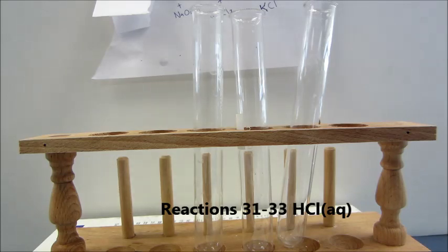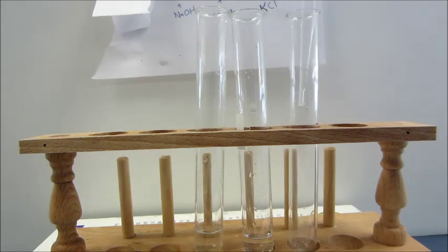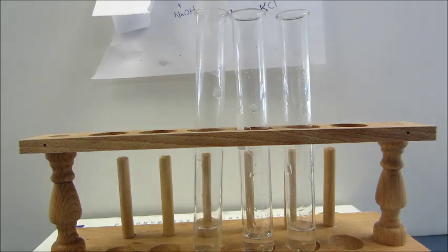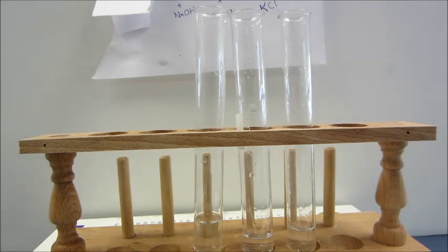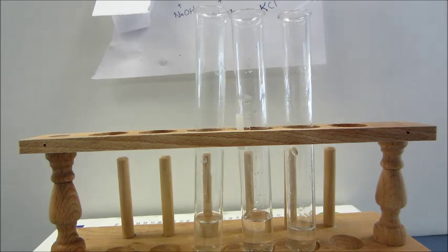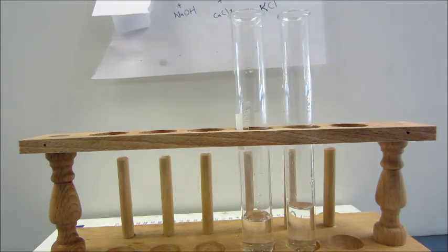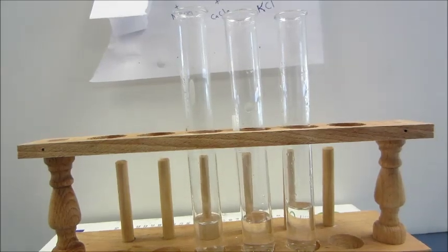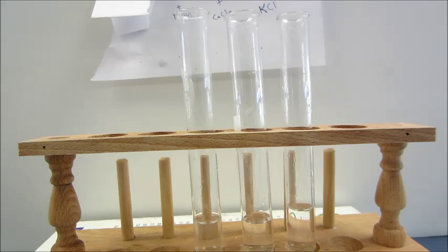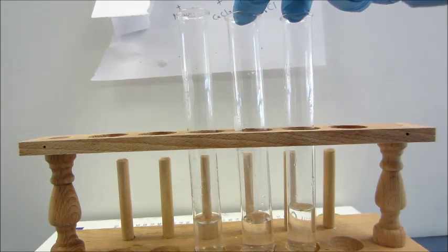Now it's time for our hydrochloric acid tests. We've got some HCl in three test tubes. To the first one, we're going to add sodium hydroxide — we predict a reaction here, since sodium hydroxide is a base. Doesn't look like anything's going on. Let's add our calcium chloride, and our potassium chloride. We see no visible reaction. With our hydrochloric acid, we predicted the sodium hydroxide would react — the sodium would leave the hydroxide, go to the chlorine, form sodium chloride, and we'd also get water, a covalent compound. But we didn't see any evidence of that. The two chloride compounds, predictably, wouldn't react — why would chlorine replace chlorine?